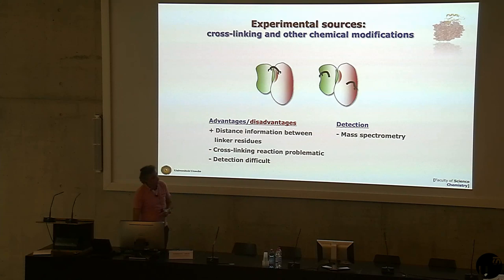What you see a lot these days are cross-linking experiments coupled with mass spectrometry as a detection method. So here you are using small chemicals that typically have two warheads, connected by a flexible linker. Those warheads, the classical ones, attach to lysine side chains on the surface of proteins. And since there are two warheads, they are going to connect to two lysines, provided they are at the right distance in space. Now, the distance depends on the linker, and there are different chemistries here.